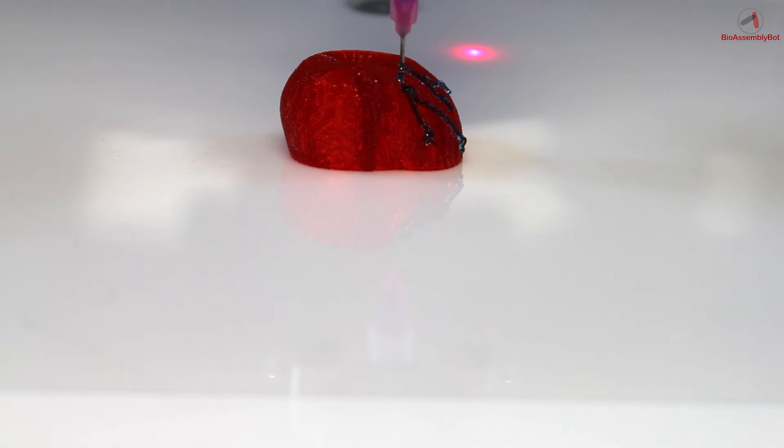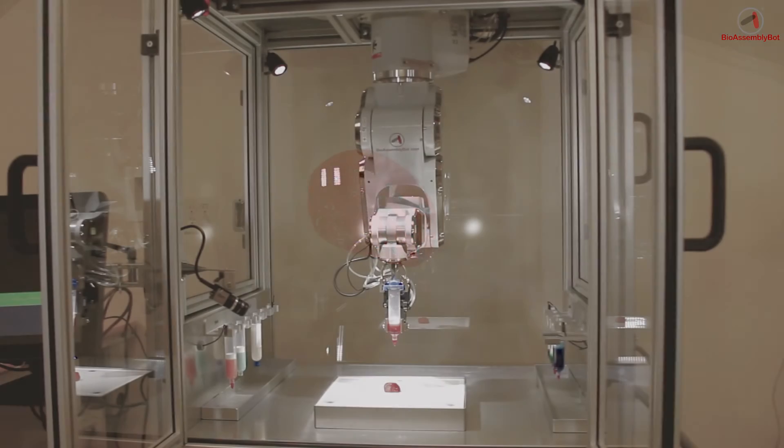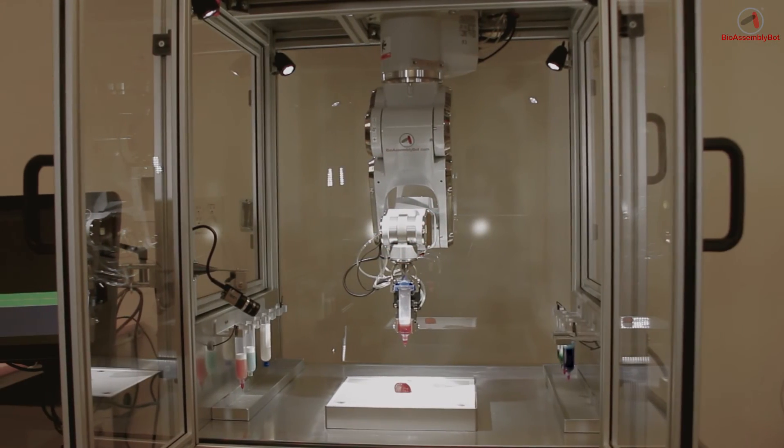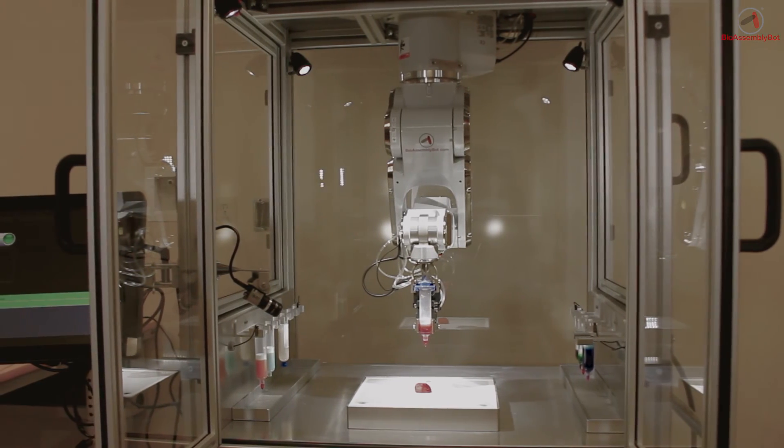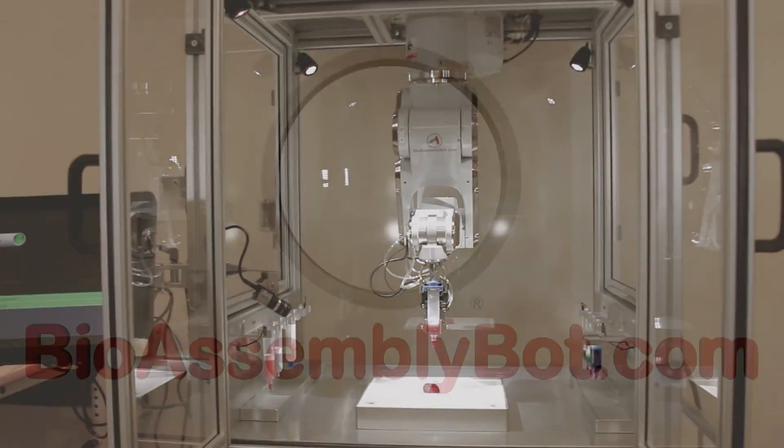Once finished, we have the foundation to perform experiments, assemble new tissue, and eventually build the heart.